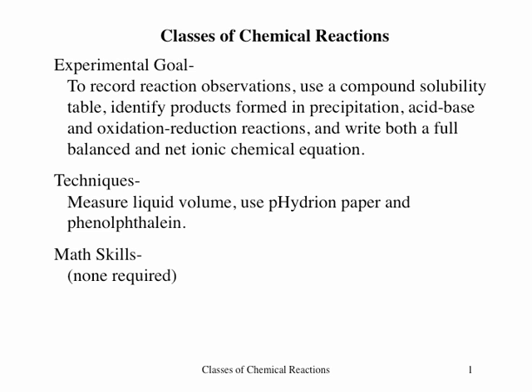In this experiment, you will examine representative reactions from the three fundamental classes of chemical reactions: precipitation, acid-base, and oxidation-reduction. When observing that a reaction occurs, the products for the reaction must be identified, and the balanced chemical equation recorded, complete with necessary coefficients and phases. This 2-week lab is completed individually.